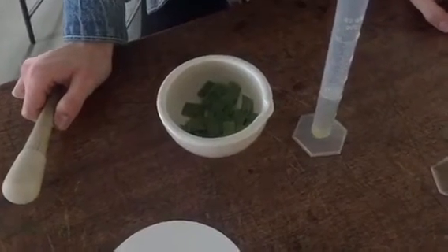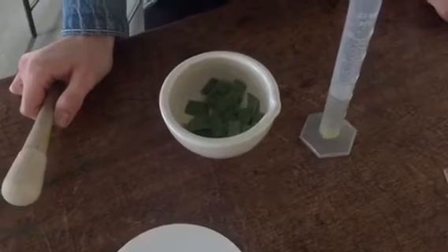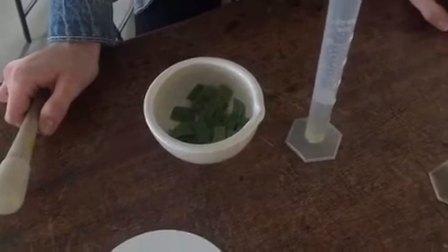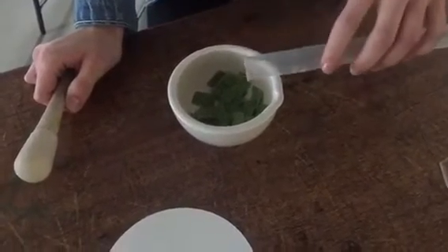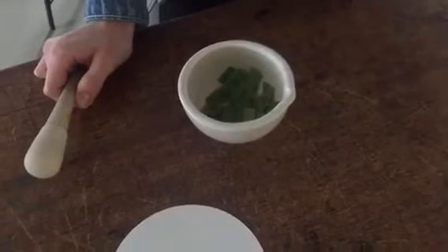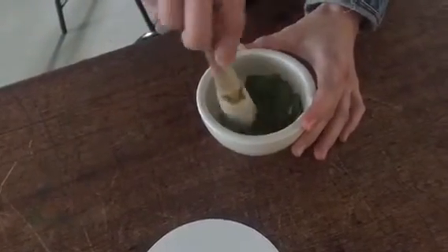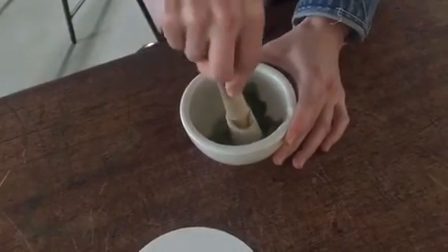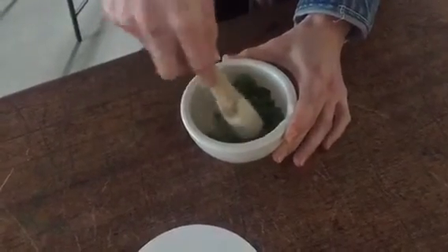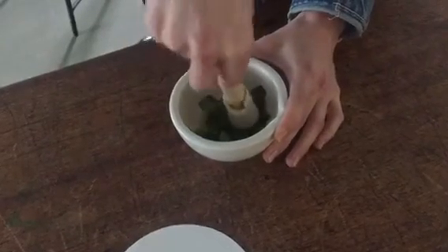We have cut up our spinach leaves and put them into the mortar with the sand. We add the isolation medium and then begin to grind it up so the cells will be broken apart and the chloroplasts will be released. If you do this for too long then you can break open the chloroplasts as well. You can also do this in a blender, but our pestle and mortar works just fine.